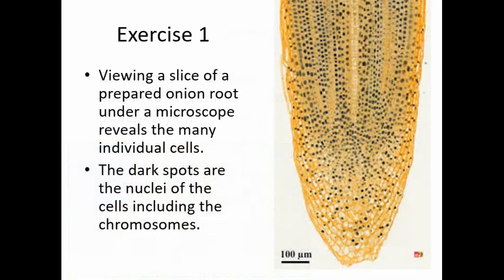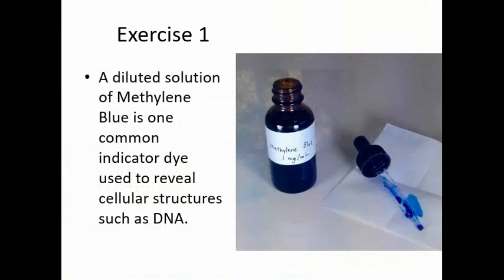If we view a slice of a prepared onion root under a microscope it reveals the many individual cells. The dark spots are the nuclei of the cells including the chromosomes, the primary genetic material. A diluted solution of methylene blue is one common indicator dye used to reveal cellular structures such as DNA.